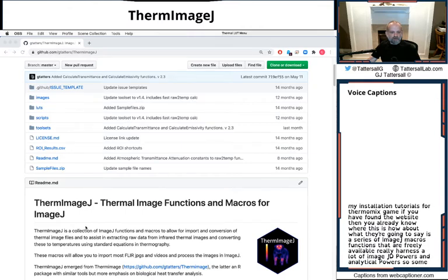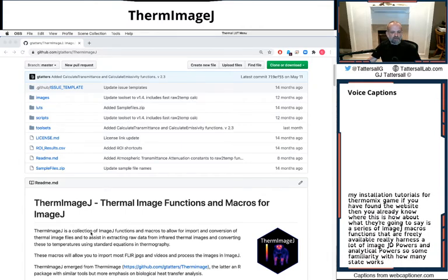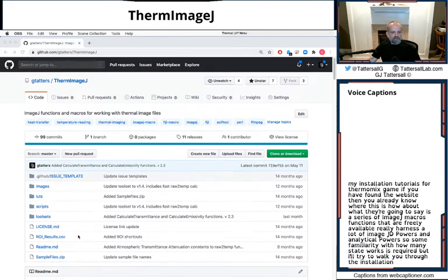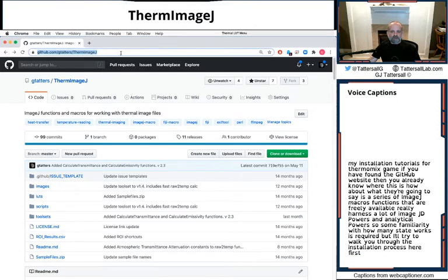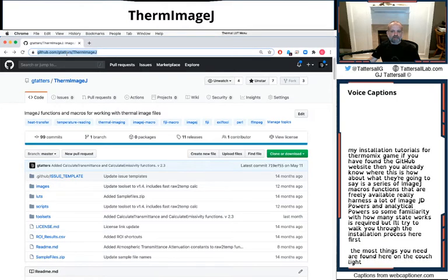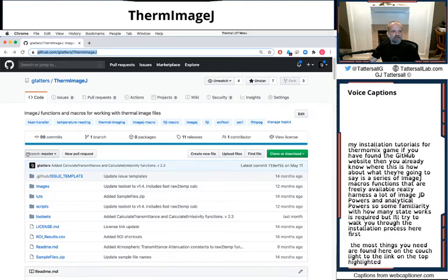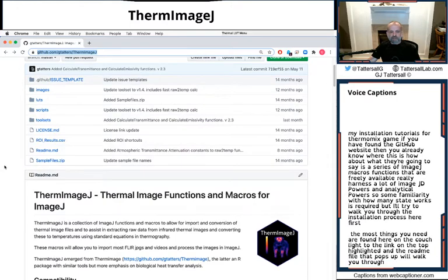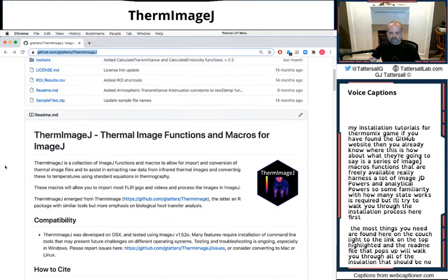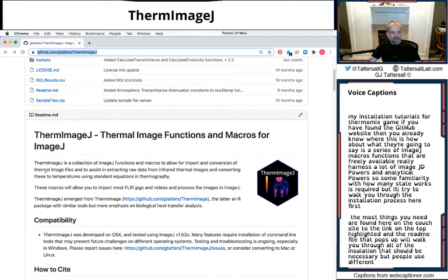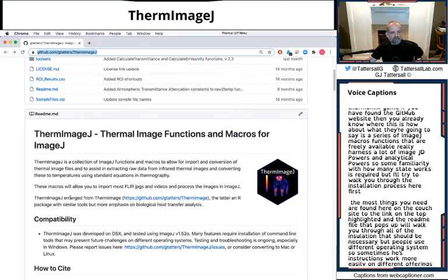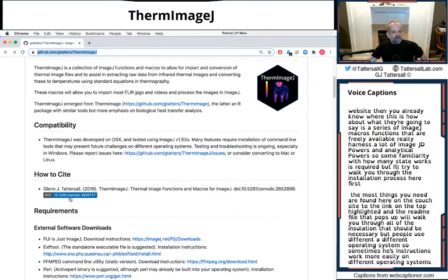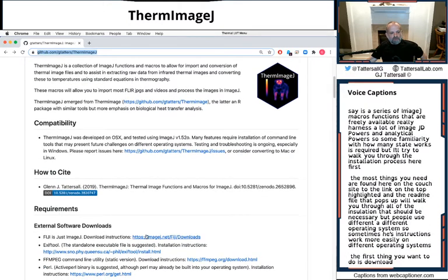Some familiarity with how ImageJ works is required, but I'll try to walk you through the installation process here first. The most things you need are found here on the GitHub site. The link on the top highlighted and the readme file that pops up will walk you through all of the installation that should be necessary. But people use different operating systems, so sometimes these instructions work more easily on different operating systems. So the first thing you want to do is download Fiji or ImageJ.